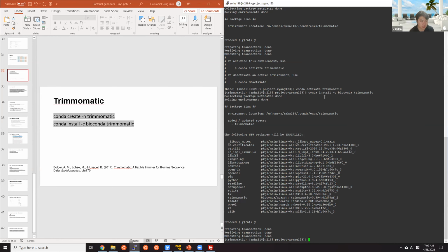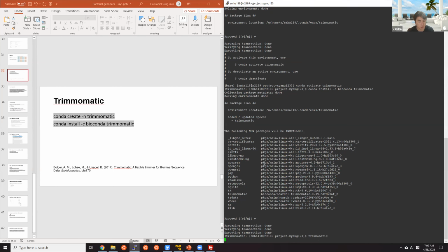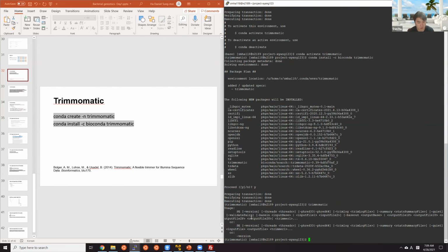Yeah, I guess I'm just gonna proceed this time. You guys, once you have it installed, you can just follow through what I have shown, okay? Once you have it installed, you'll be able to type in Trimmomatic, and you will see some printouts if it's properly installed.